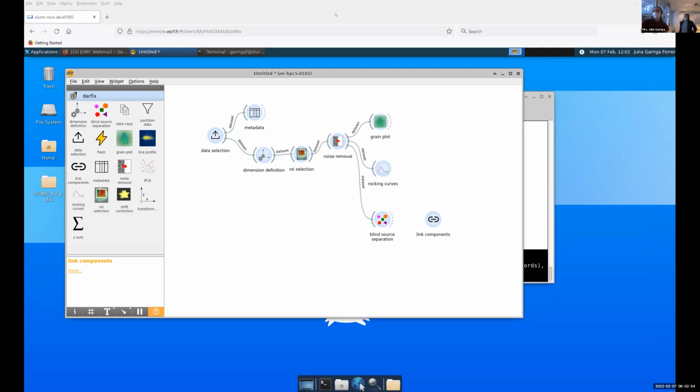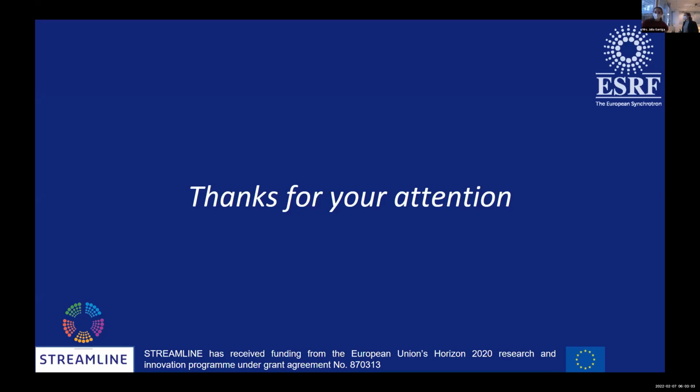Please, when you leave the Guacamole application, close the terminals and the processes, and exit the allocation. That way the people from the cluster will be happy with us. With Control D, you can first exit the Darfix environment, and Control D again will exit the allocation.